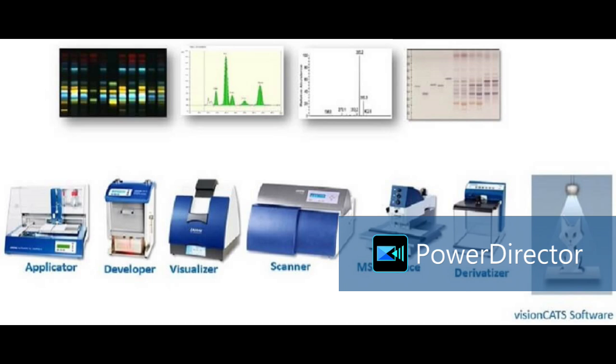There are a total of 7 to 8 HPTLC methods for honey. I have added only one slide because it is more about forensic, but I will show you those 7 others also during our session. Because quality-wise, only few species yield good quality. So we can differentiate monofloral honey and polyfloral honey, and which flowers it is from we can identify. Means the exact flower standard we can apply with the honey. If some common bands from flowers are detected in honey, we can identify that.